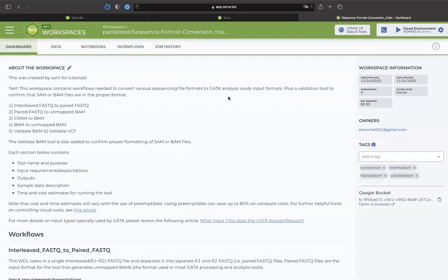So let's go to the dashboard. Again, over here, you get more information about your workspace: when it was created, the last date updated, owner, some of the jobs you've submitted. We haven't submitted any jobs yet, so 0. And your cost per month, owners. Oops. Anyway, let's see.